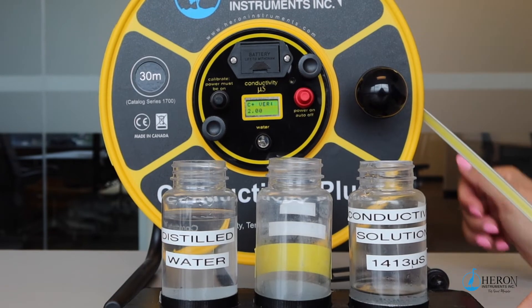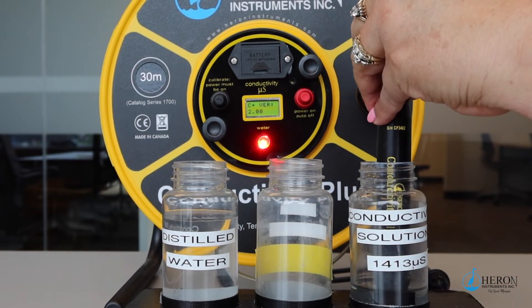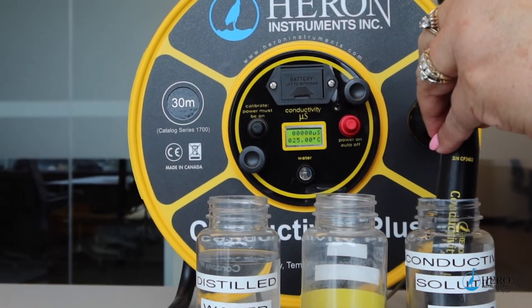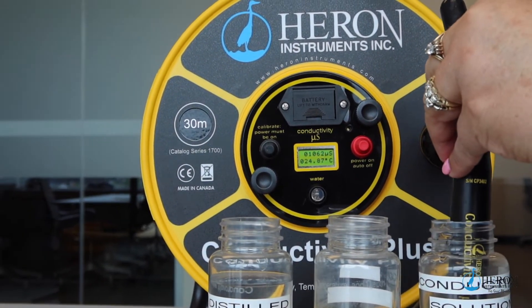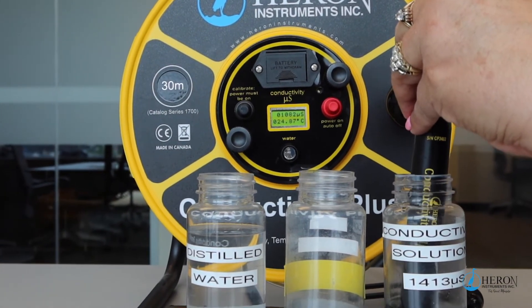Place the probe in the 1413 microsiemen solution and gently position the probe so that air bubbles are not trapped under the shroud. Jiggle the probe a bit. Wait approximately 60 seconds for readings to stabilize.